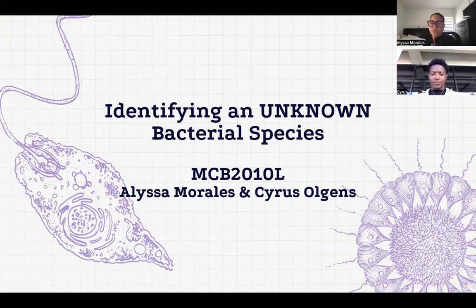Throughout the course of the semester, we worked on identifying an unknown bacteria that we were given at the start of the semester. Through a series of biochemical testing, we eventually were able to resolve what bacteria we were given at the beginning of the semester.